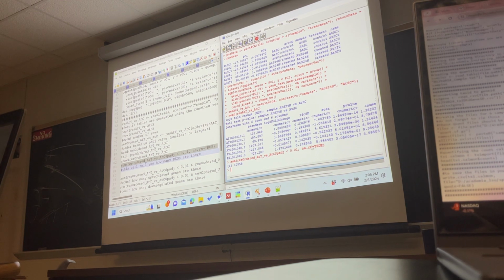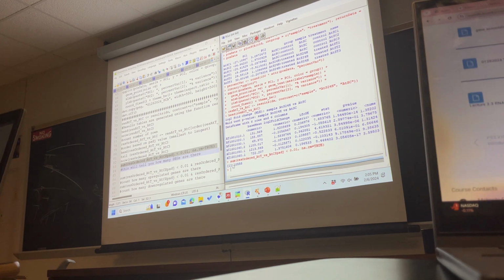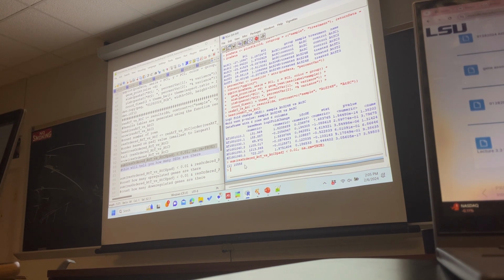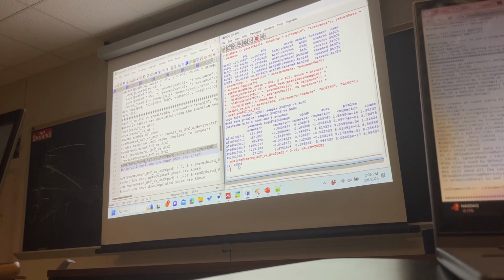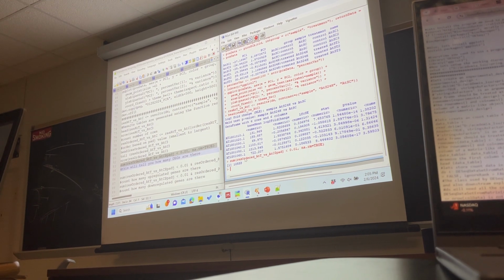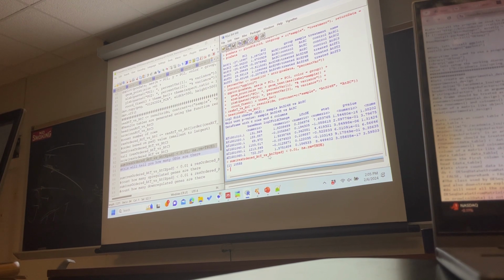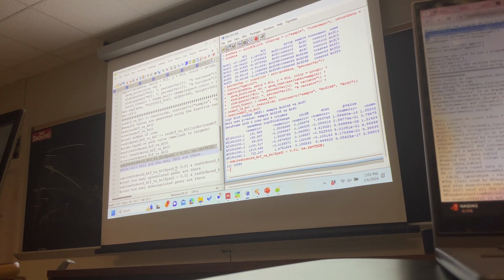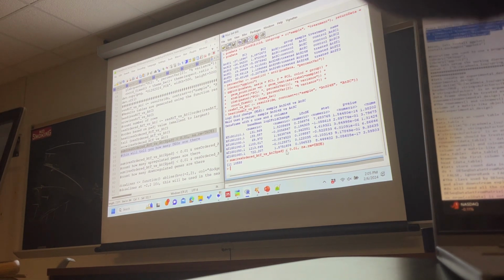If I ask that, then it will say the number of genes that are passing this threshold. Since this is really a high salt concentration, and this is a salt sensitive species, many genes already responded to the salt stress here. So 10,000 genes are basically differentially expressed upon salt stress, either up or down regulated. But you can always set up a different threshold, like this is a really stringent adjusted p-value cutoff.